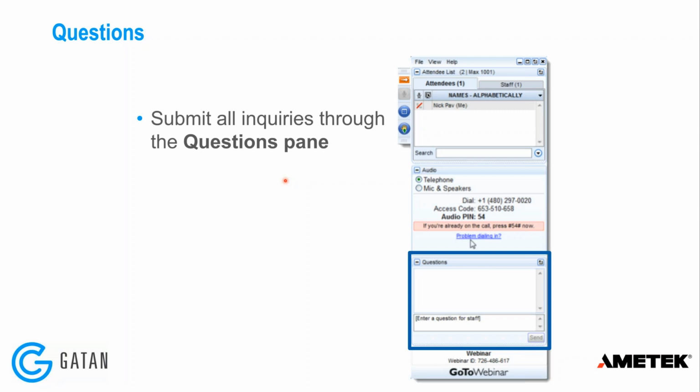We did have quite a few questions coming in during the presentation. I was trying to get to some of them in real time. Typing and listening at the same time are a little bit challenging. But we did have some questions.